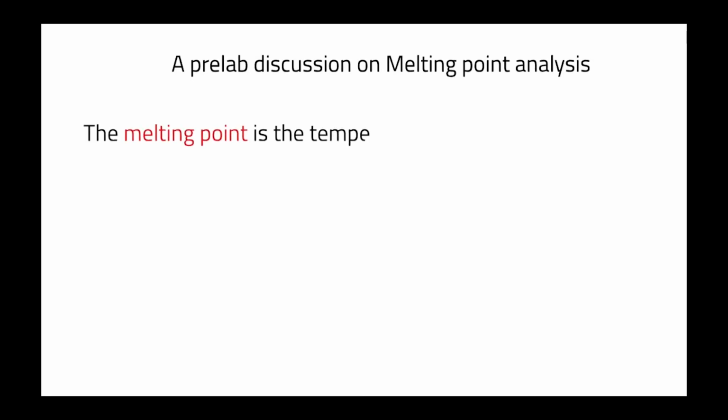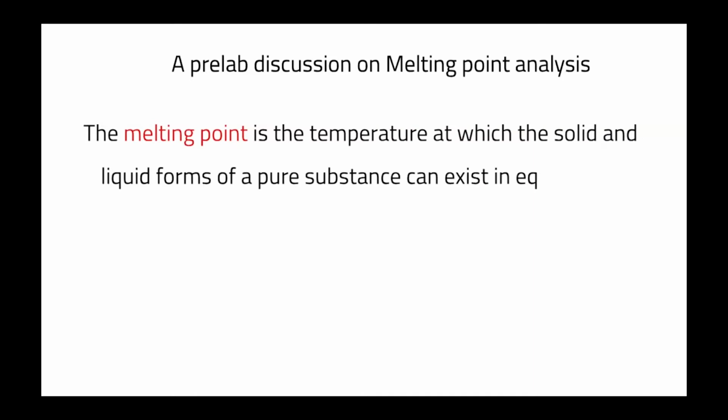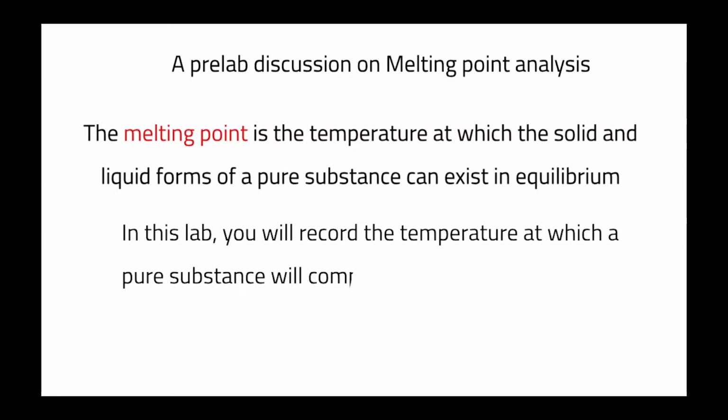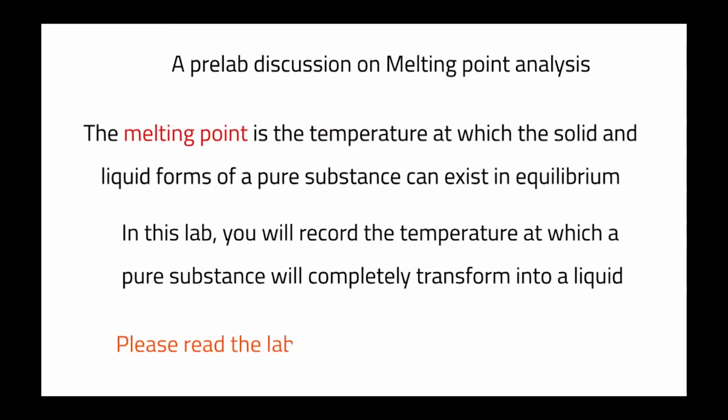This is a pre-lab discussion on melting point analysis. The melting point is the temperature at which the solid and liquid forms of a pure substance can exist in equilibrium. In this lab, you will record the temperature at which a pure substance will completely transform into a liquid. Please read the lab before you begin the experiment.